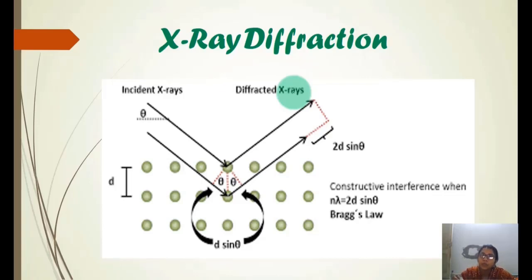When this light falls over the obstacle or aperture, it will bend through its corner and create a diffraction pattern, that is bright and dark fringes, and the human eye can see the visible light. So when we use light diffraction, basically we are using an electromagnetic wave falling in the visible region. The diffraction pattern will also consist of bright and dark fringes.